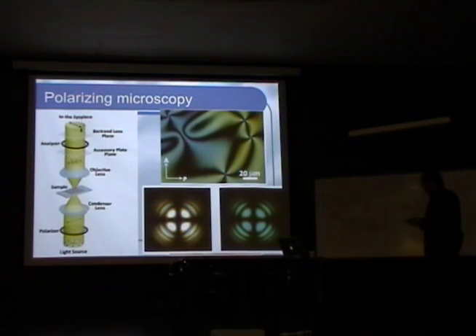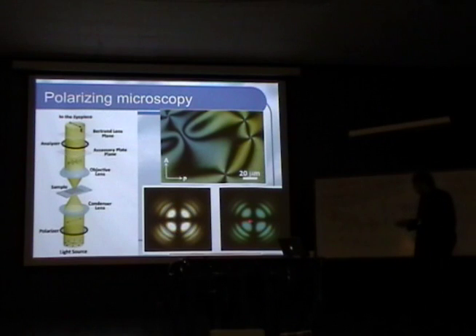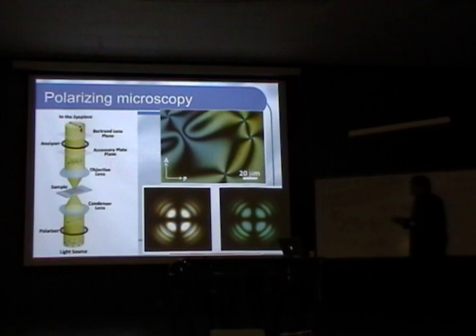The interference of light then allows one to form the so-called conoscopic image, examples of which you can see in here. Those are the images obtained for the sample with the orientation of the optical axis of the birefringent sample parallel to the optical axis of the microscope. Those are uniaxial samples that have been probed in here. The function of the Bertrand lens in this case is to bring into focus the image at the back aperture of the objective lens, right?